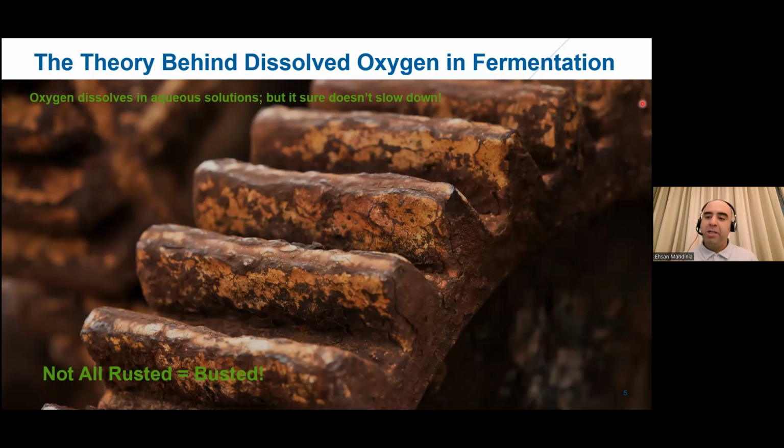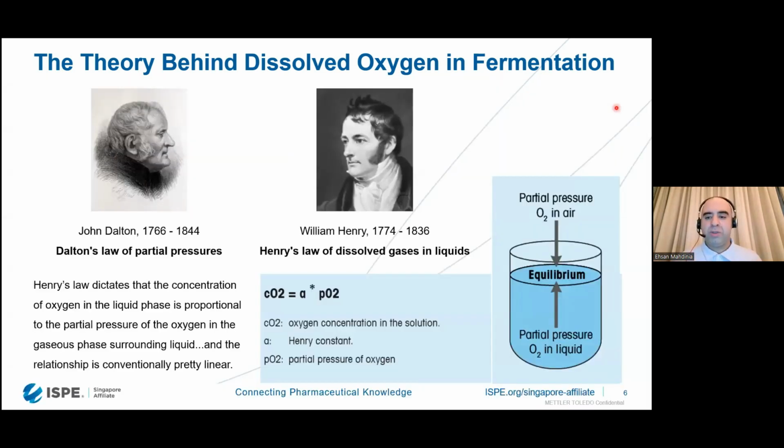But life has learned, that is, living cells that depend on aerobic fermentation have learned how to harness such reactivity and put it to good use. The fish in the ocean, us breathing the air and grabbing onto the oxygen for our catabolism in the cells, we know exactly how to put that reactivity to good use. And as for the solubility of oxygen, for providing the oxygen in the soluble form, oxygen follows the exact same principles as any other gas solubilizing in aqueous solution.